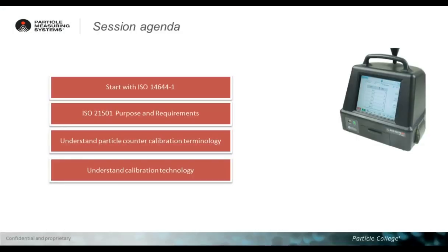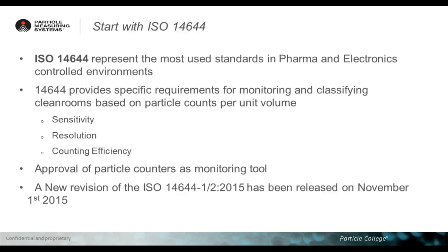The agenda of today's webinar includes, first of all, a brief discussion about ISO 14644, and I will explain shortly why I want to mention this standard as well. Then we will go through the purpose and requirements of ISO 21501, and of course, we need to touch on particle counter terminology and how a particle counter works, at least in theory.